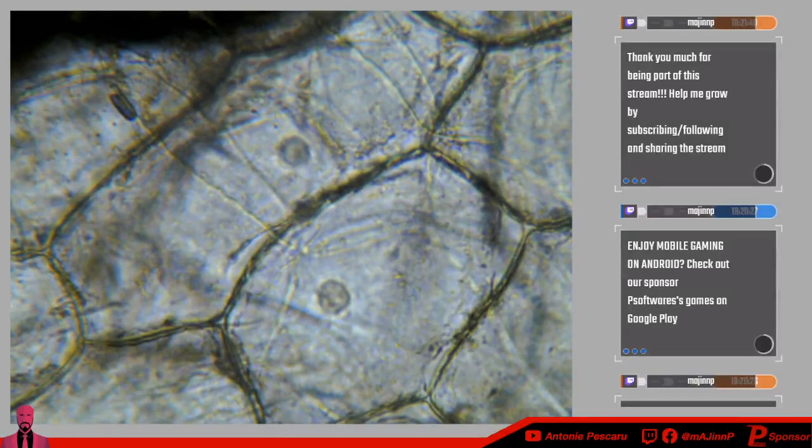The reason for that is that before starting the stream, I was trying to get nuclei, and I couldn't really find any of them.